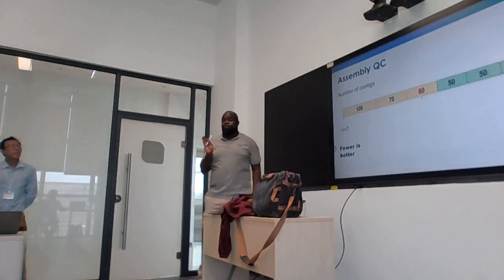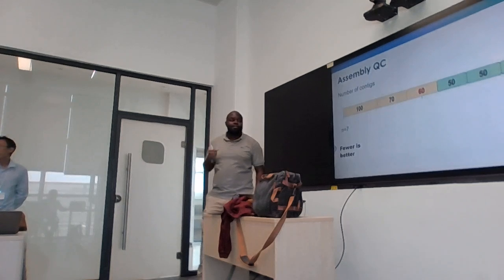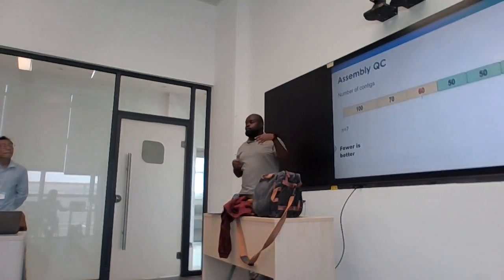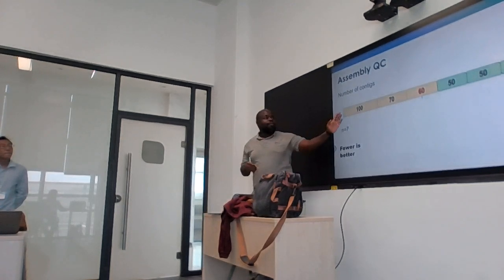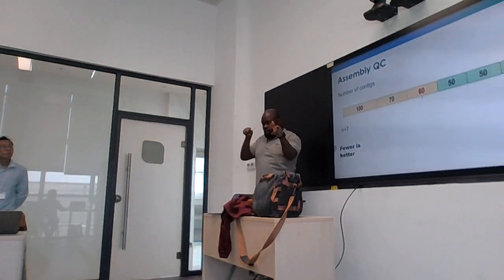Okay. So just remember, with de novo assembly, you will not get one assembly. Consensus, you'll always get one. And the only difference is that for consensus, for the positions of the genome that you could not sequence, it adds Ns. You remember the Ns that Peter talked about last week, right?